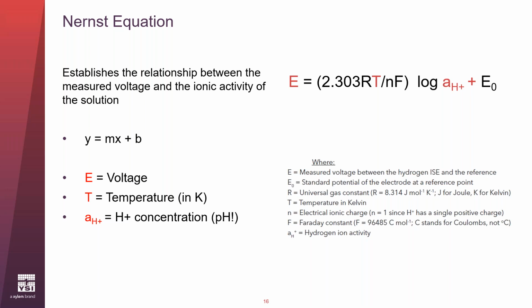Here I've put the slope-intercept under the Nernst equation, so you can have an idea of how it will look when it is graphed. We'll talk more on that subject when we get to the calibration. We are going to see more of the Nernst equation. It is the key to all of this.